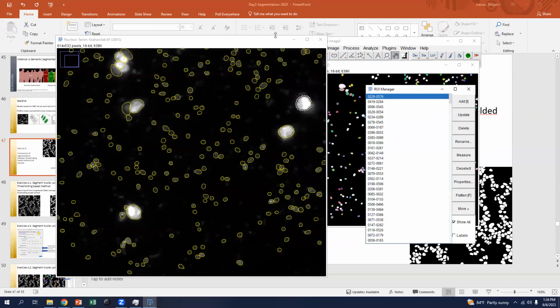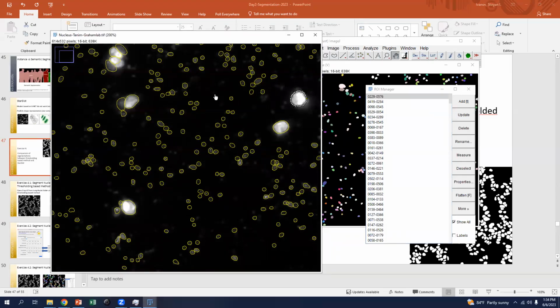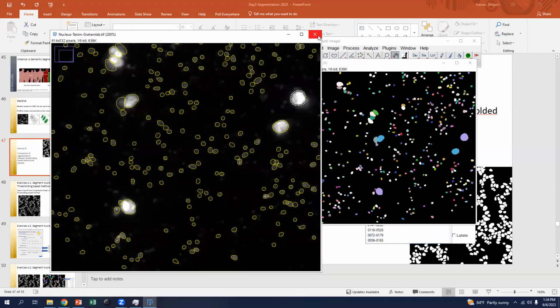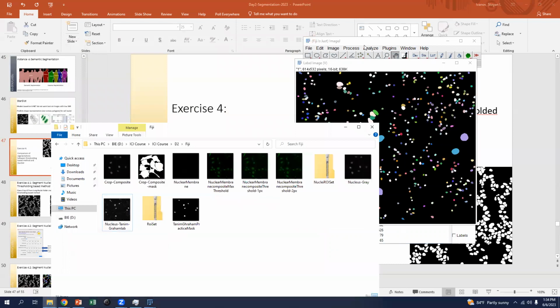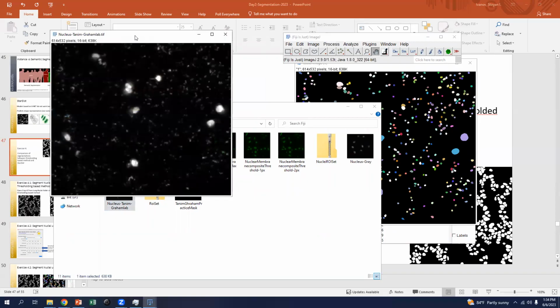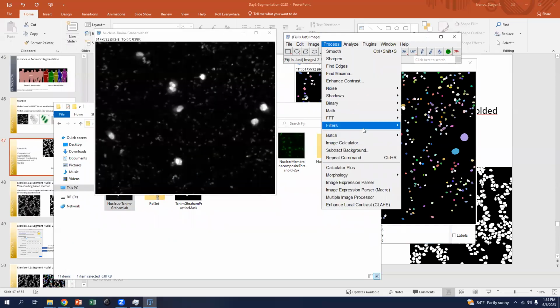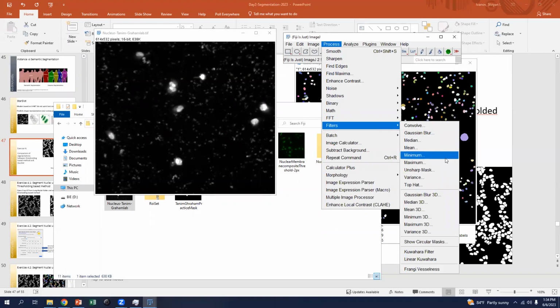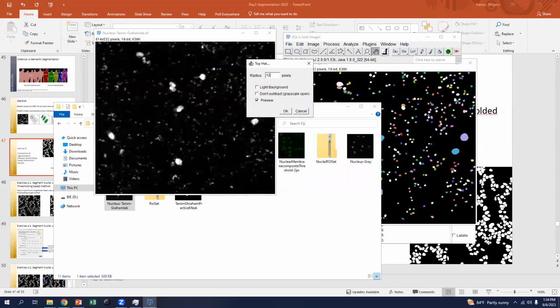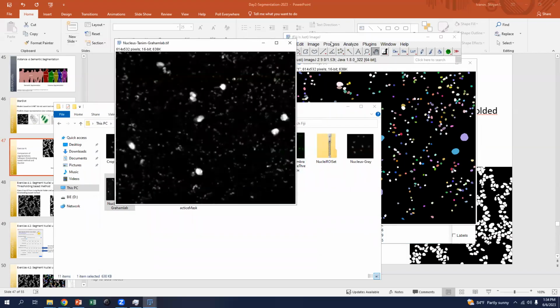But once we have these ROIs, we can do the same thing basically. So let's start again. Let's filter the image to get rid of some of that noise, and then try and do the cell membrane calculation again. So we've got it here. Let's filter. Process filter.